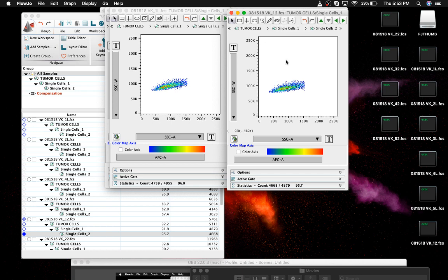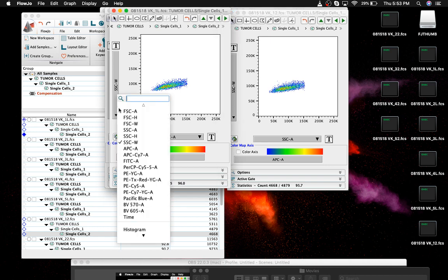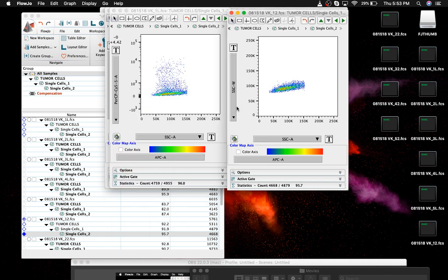So what I did was, when I did the experiment, towards the end, I did something called a dead cell staining. When I'm doing the experiments, I want to be pretty sure I'm not including dead cells in my data. So I have stained these cells with propidium iodide, the PI stain, which can be detected in the PerCP channel. What you see here right now in front of me is these parts are all dead cells and these are live cells. The cells which have incorporated the PI stain are usually the dead cells, and hence they are detected in this range.